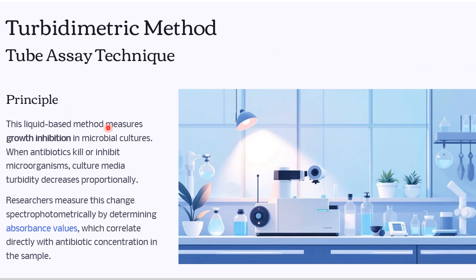The absorbance is then correlated with the concentration determination of the unknown antibiotic. So this is the principle behind the turbidimetric assay.